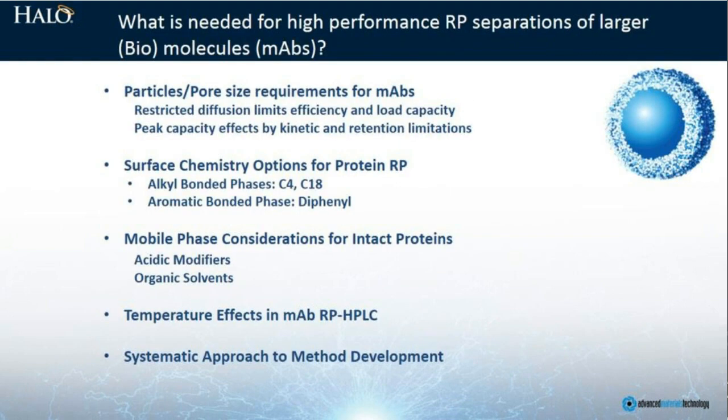Now, this was a gratifying development, but really my personal interest as a biochemist was how can we utilize this technology to enable high performance separations for larger molecules, and in particular larger biomolecules. And in today's discussion, that will really focus around monoclonal antibodies.